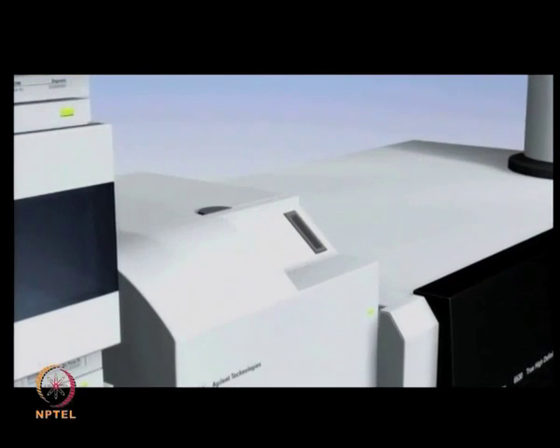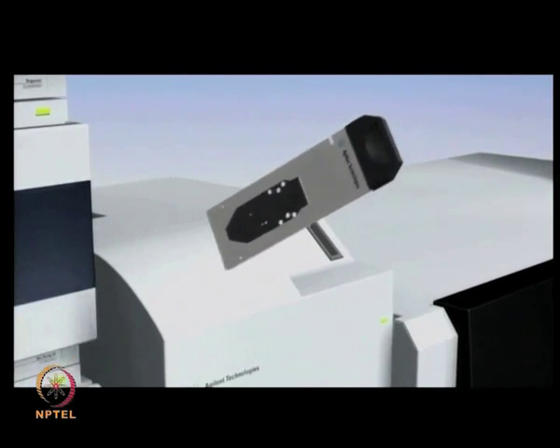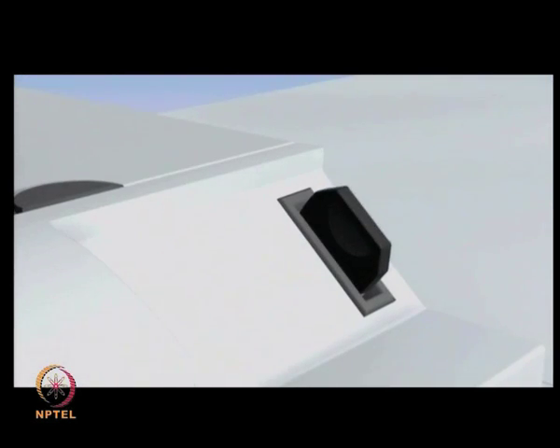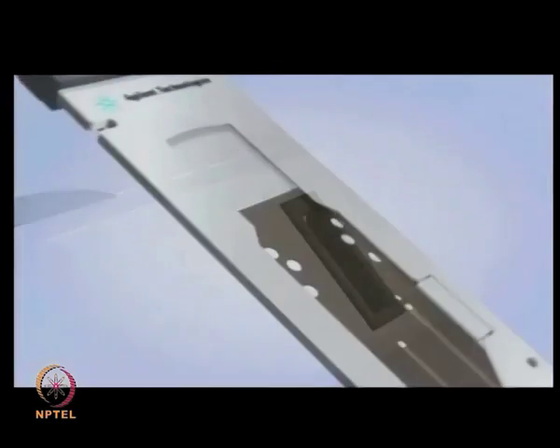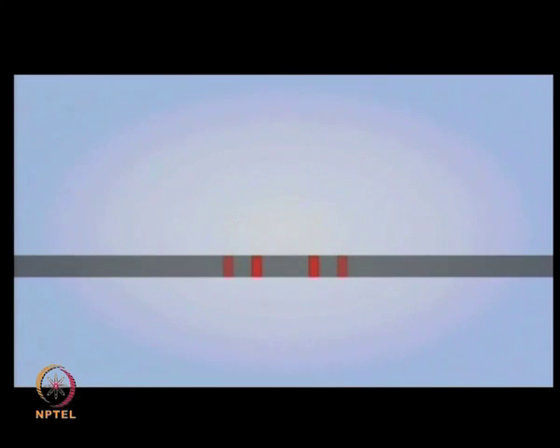The flexibility of the HPLC chip design and the HPLC chip MS interface microvalve technology in integrating additional chemistries and separation strategies opens up a wide range of potential solutions for many research challenges. On-chip multi-dimensional nano-LC is one of many possible new applications.